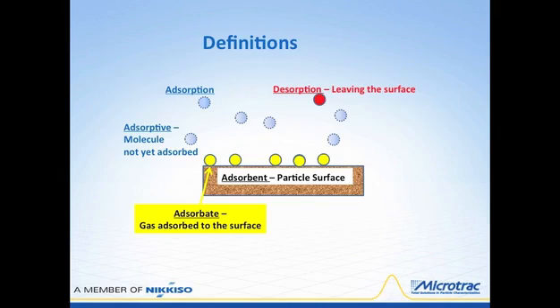Further, with some definitions, the first word that's important is the concept of a molecule being an adsorptive. This is a molecule that's floating around near our particle surface, and our particle surface has the terminology being an adsorbent, and this molecule is not yet adsorbed.